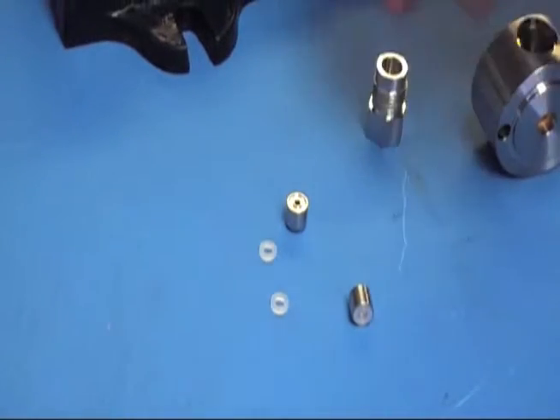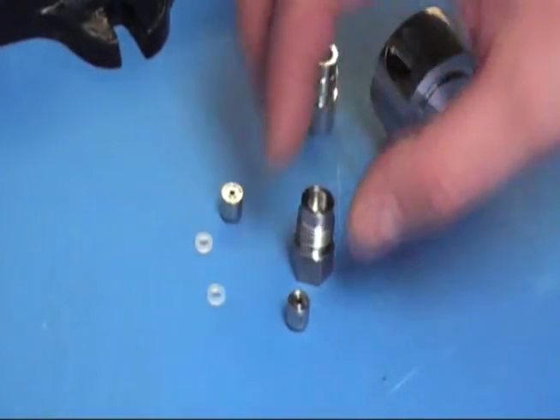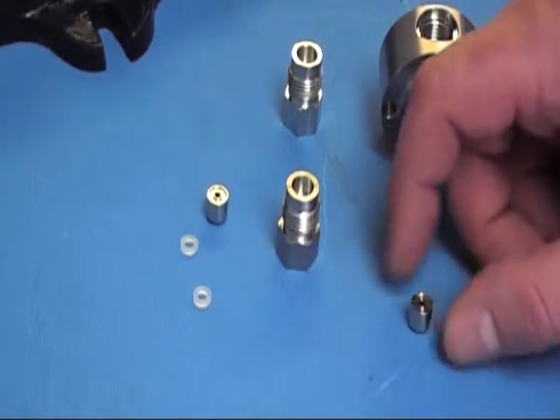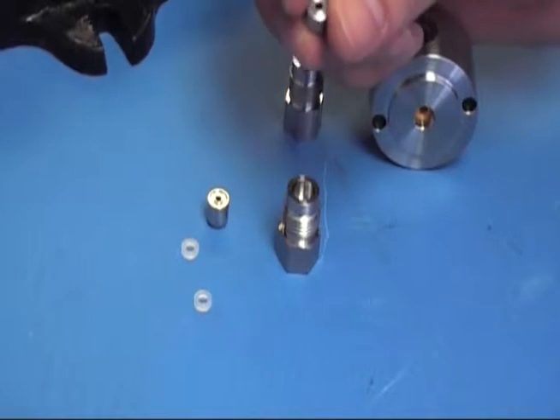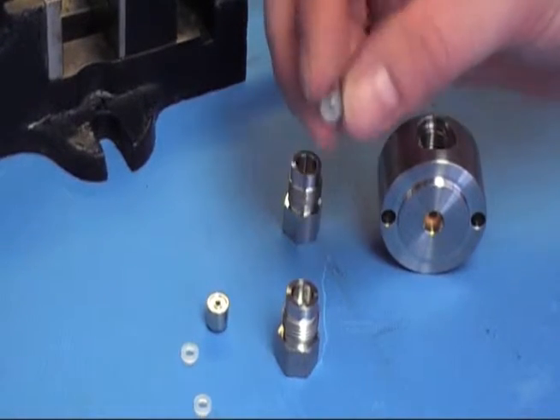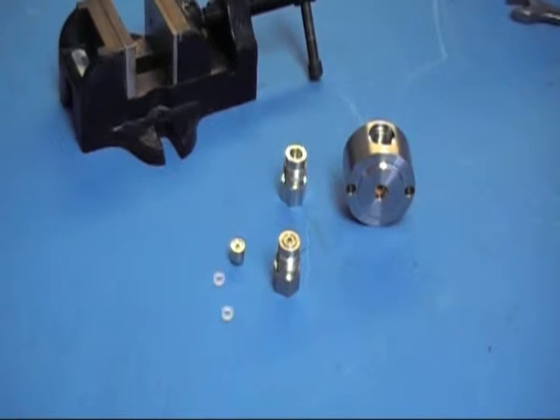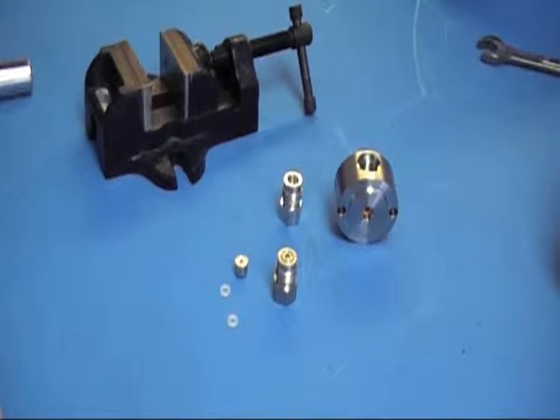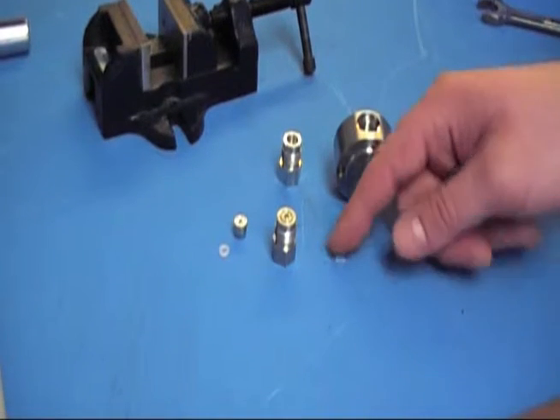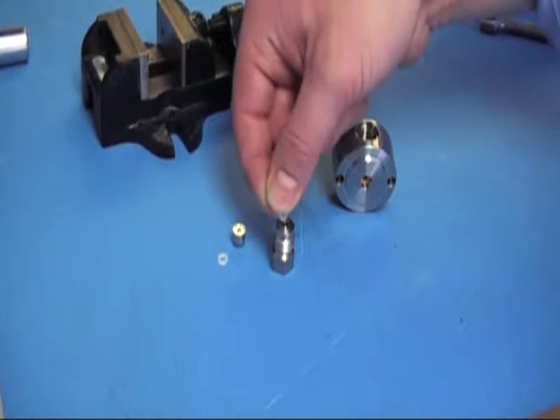We'll start with the inlet. Grab your inlet check valve housing. For the inlet, since it's usually on the bottom of the head, you're going to want the orientation arrow facing up, which means the stainless side will be facing up and the PEEK seat will be facing down. In order for the check valve to properly seal to the head, we add a check valve seal washer, which goes on the stainless side of the check valve — the side that seals with the head — and you just place that on.